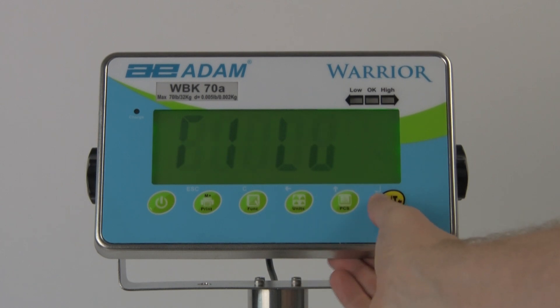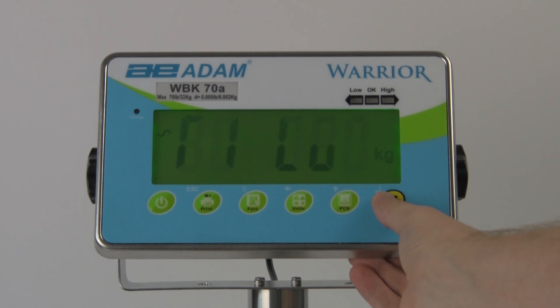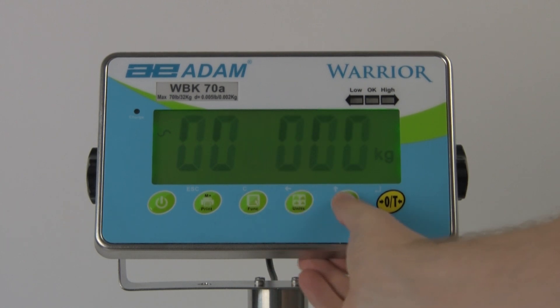To use the check weighing function, first enter the weight limit for low weight. Then enter the limit for high weight. Anything between those two limits is considered acceptable or okay.